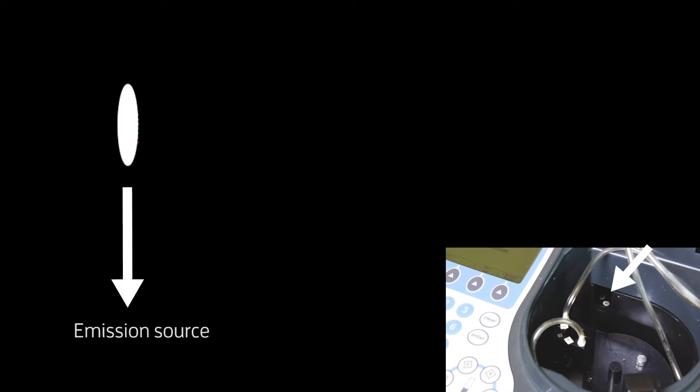Firstly we have an emission source. This produces light upon which the entire technique depends. It must be stable and bright across the range of wavelengths required in order that false readings due to inherent variation don't occur. Emission sources include tungsten and halogen lamps for example.